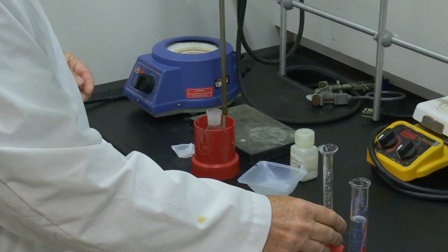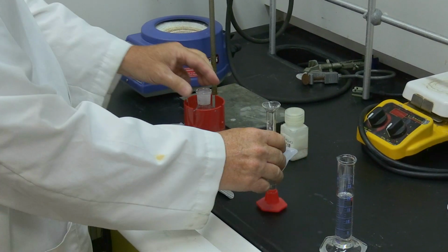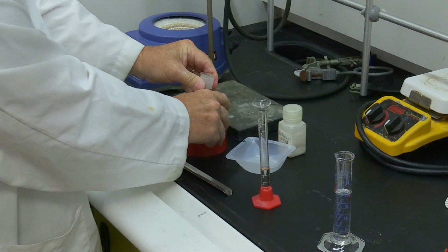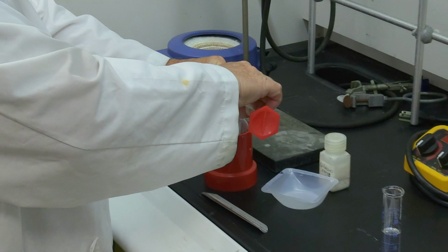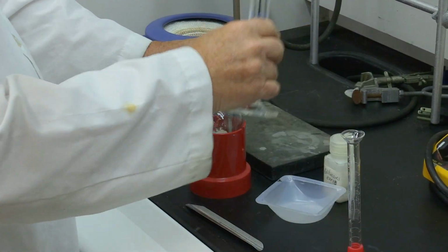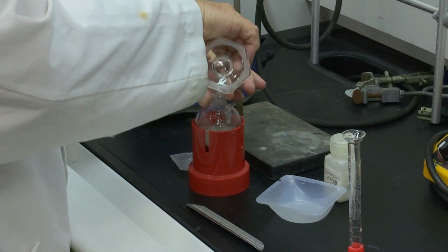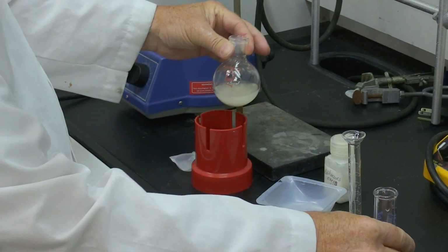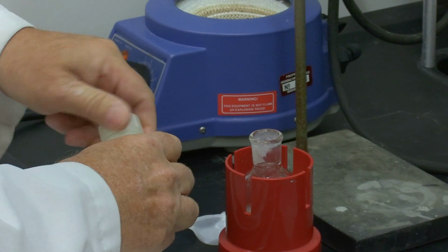And now we can add our benzaldehyde and our benzyl alcohol, in the quantities that I already measured. Good. So I have a good mix with a reflux and boiling.